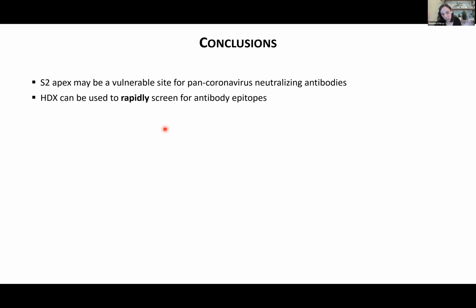So for our ion exchange column, for example, we do that at low pH. And actually that's one thing I probably wouldn't compromise a lot on, because the pH has quite an effect, but we don't do it at super low temperatures. It's just about doing it as fast as possible and knowing that that's going to reduce your signal a little bit, but that doesn't mean that you lose your whole signal. You can still detect a difference. But yes, very good point. You are restricted to a low pH range and as cold a temperature as possible.